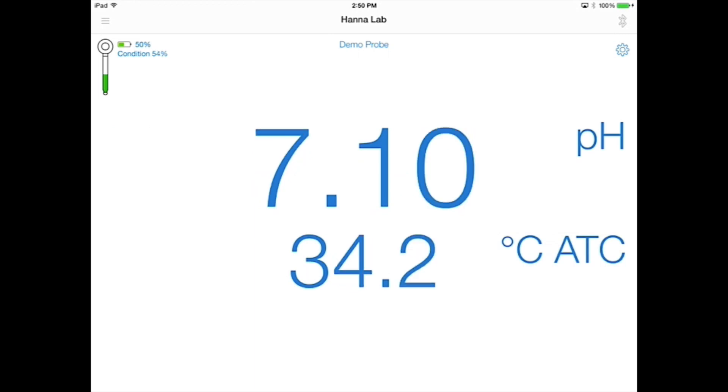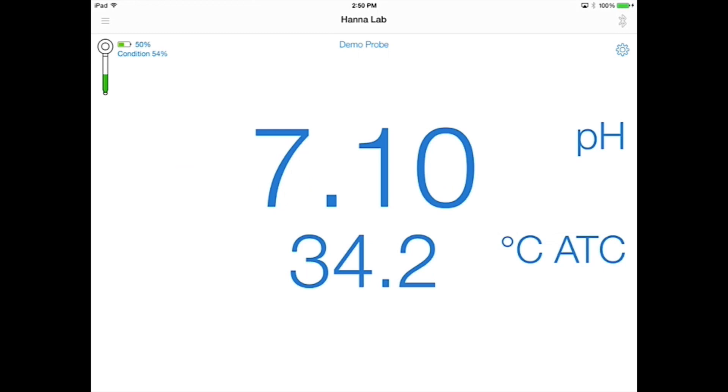Here you'll see fields for the electrode condition and battery life, the electrode name, the measurement mode and its value, the temperature unit and its value, and the compensation type.